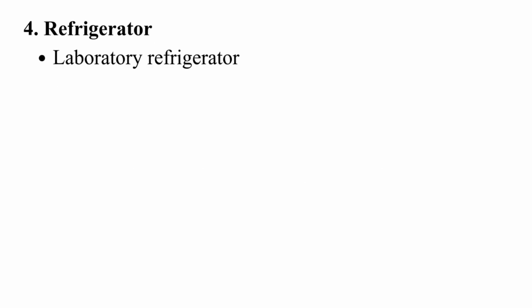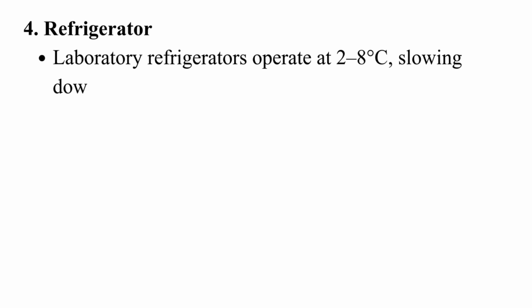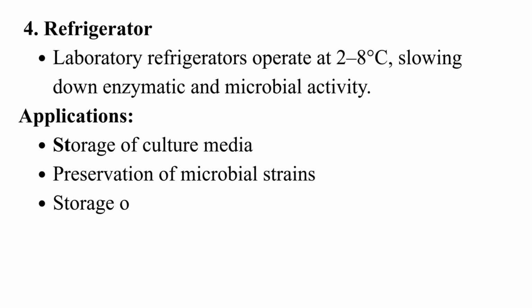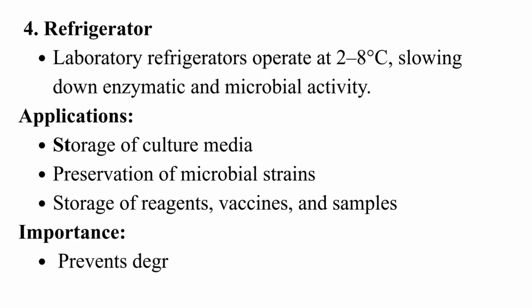Refrigerator. Laboratory refrigerators operate at 2 to 8 degrees Celsius, slowing down enzymatic and microbial activity. Applications: storage of culture media, preservation of microbial strains, storage of reagents, vaccines, and samples. Importance: prevents degradation and contamination.